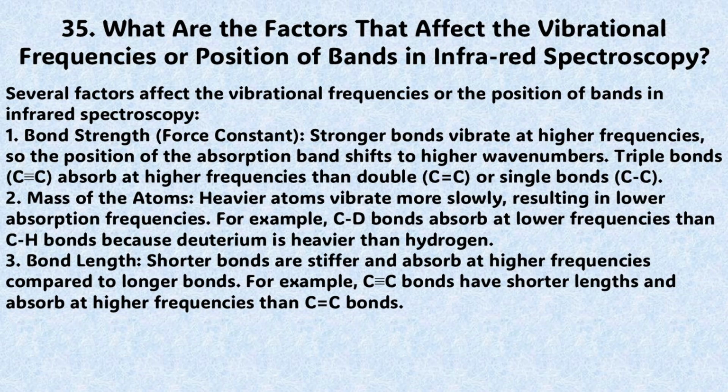Now we will move to question number 35. What are the factors that affect the vibrational frequencies or position of bands in infrared spectroscopy? The answer to this question is very simple. Several factors affect the vibrational frequencies or the position of bands in infrared spectroscopy.